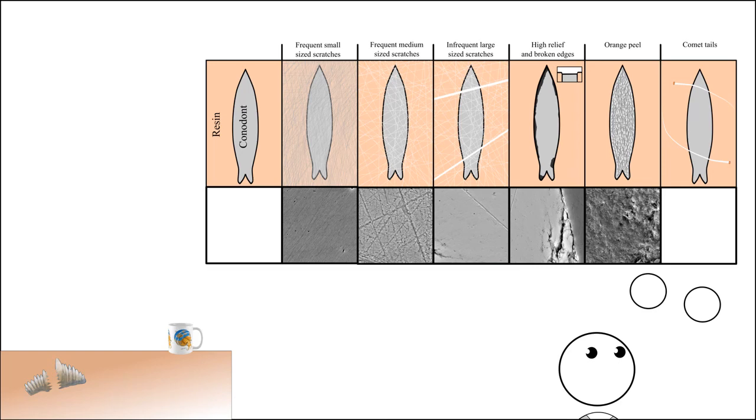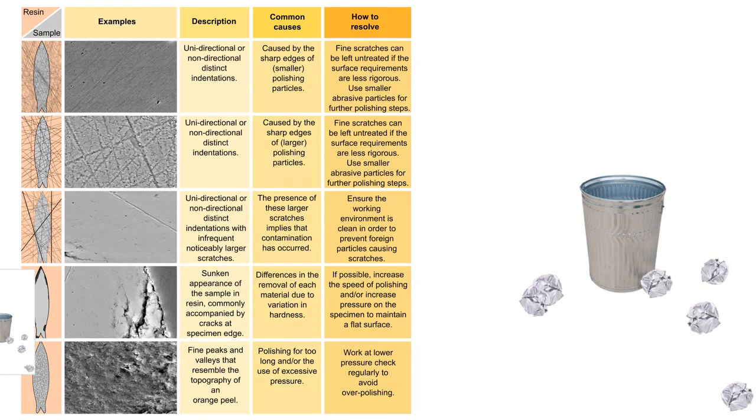The next is comet trails and luckily I don't have a photo of this but comet trails are where contamination embedded in your resin becomes loose from the grinding stage and moves across your sample and scratches it. This is just a summary of everything that I had said of all of the missed shots when we're trying to get the ball into the trash can.